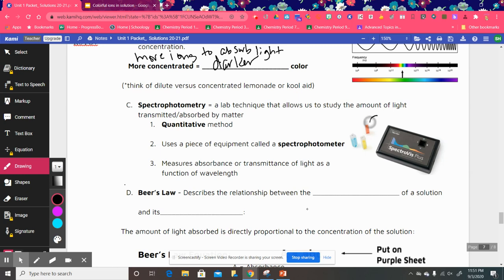This is what our spectrophotometers look like. And then these little vials right here are plastic. They hold about two and a half or three milliliters of liquid. And those are called cuvettes. So it measures absorbance or transmittance of light as a function of wavelength.